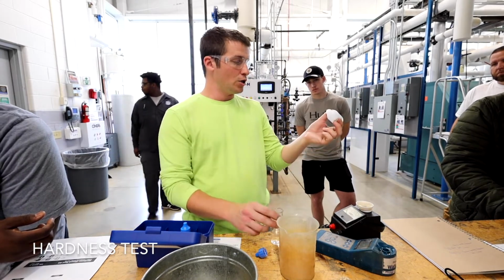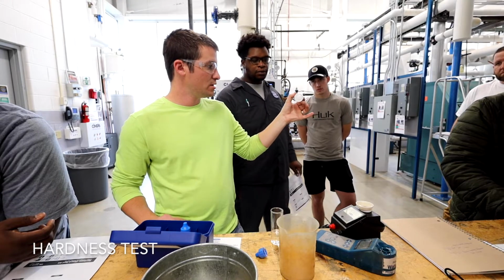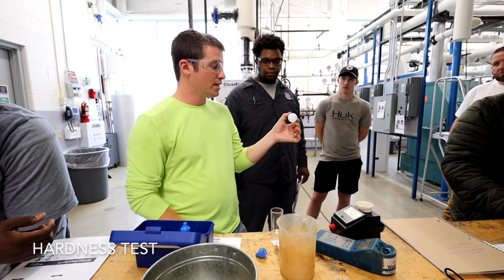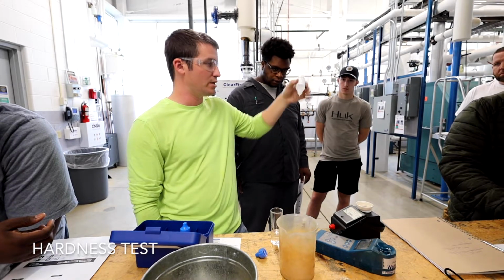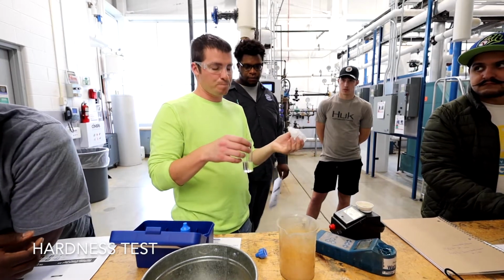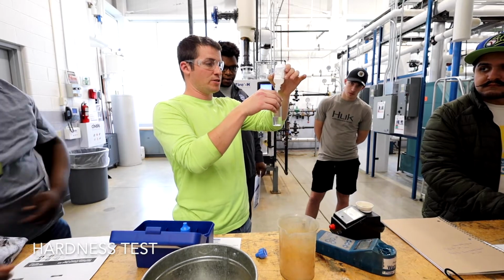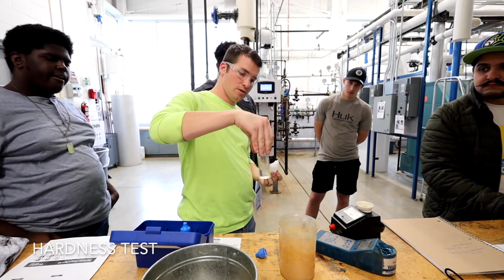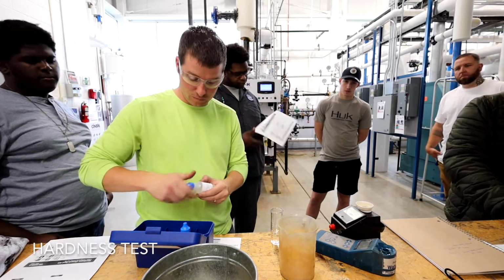A thing to note is you don't want to hold your dropper bottle sideways like this. This tip is designed to give a specific amount, and when it's sideways, it's probably going to give a smaller drop than if I hold it vertically. So you want to hold it straight up and down, okay? And the more you do it, the easier it becomes, because they do maybe come out faster than you're ready. So 1, 2, 3, 4, 5. Okay, and then just swirl to mix it. So that's step 2.